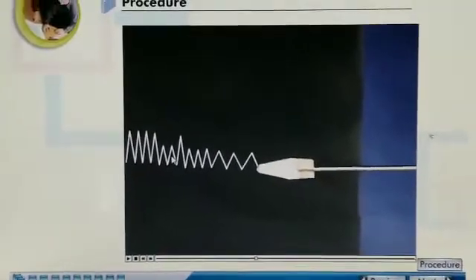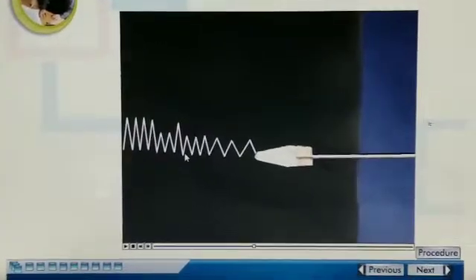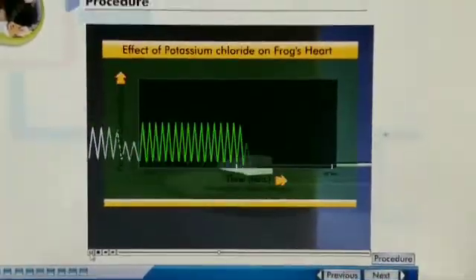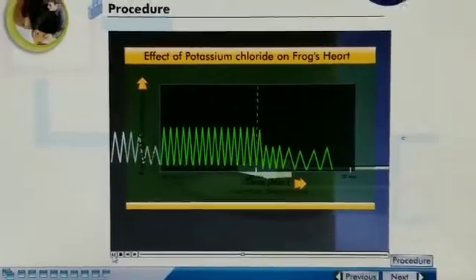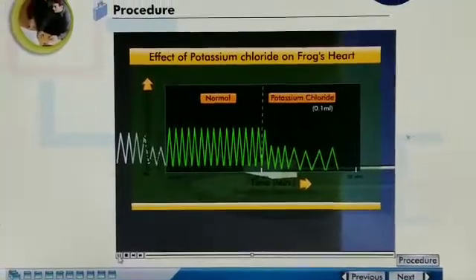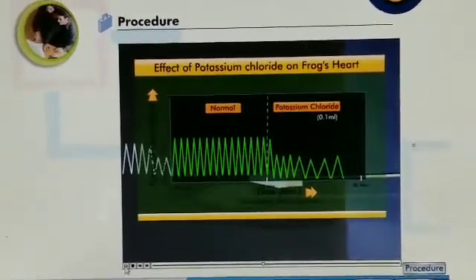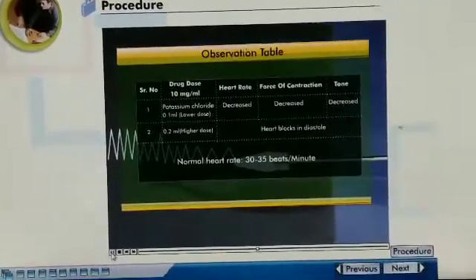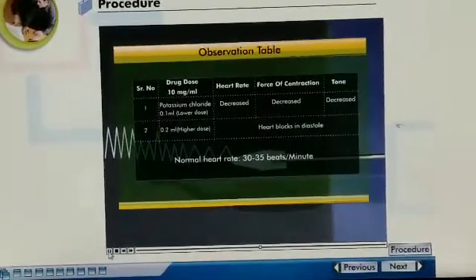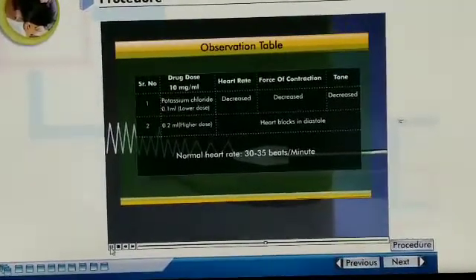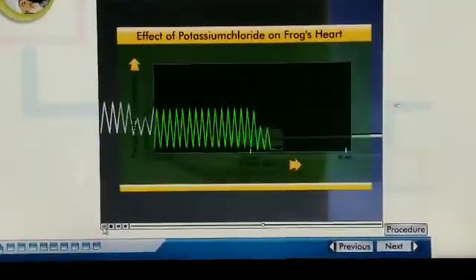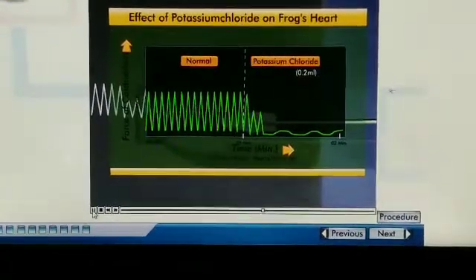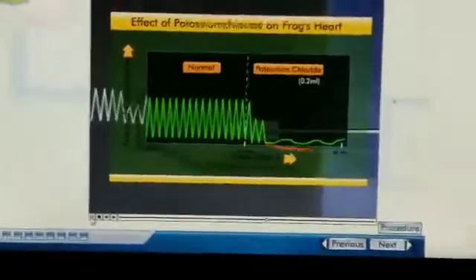Therefore, we can say that potassium chloride decreases the heart rate and force of contraction. The rate of contraction, force of contraction, tone, and rhythmicity are all decreased. Repeating the same procedure by injecting 0.2 ml of stock solution of potassium chloride, we observe that with increasing concentration of potassium chloride, the heart relaxes slowly and finally stops in diastole.